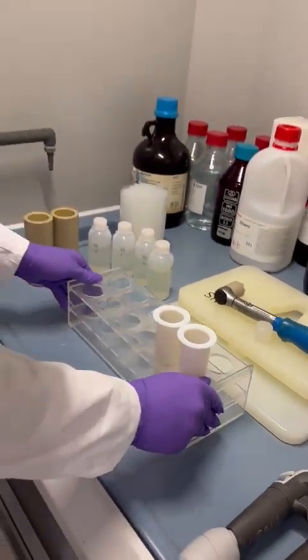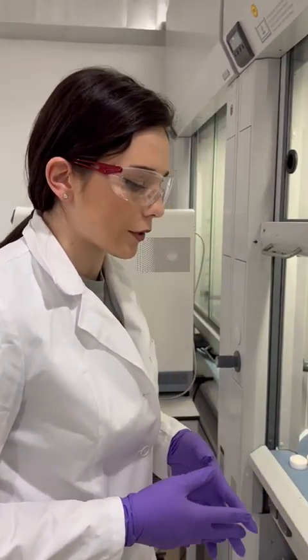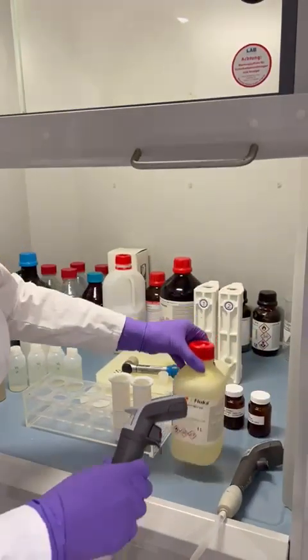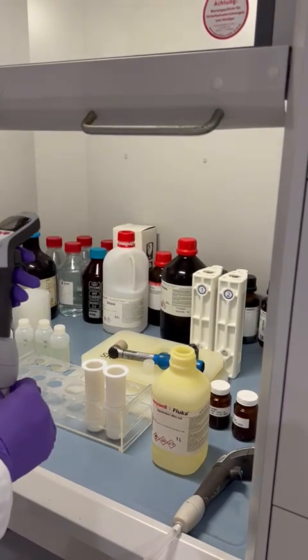After that, we are adding our reagents. First of all, we are adding 8 milliliters of nitric acid into each microwave vessel.